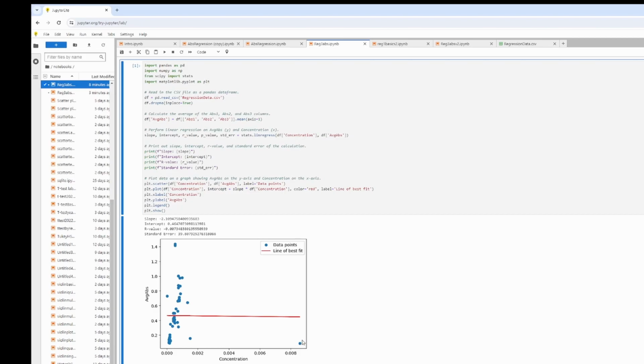And this thing here is 10 times greater than any other value here, and it's causing havoc. So what we need to do is on our data set here, so when we pull in the concentration values, we need to have another row up here, so another piece of code. So after we drop all the null values, we also need to get rid of any rows where the concentration is greater than a certain value.